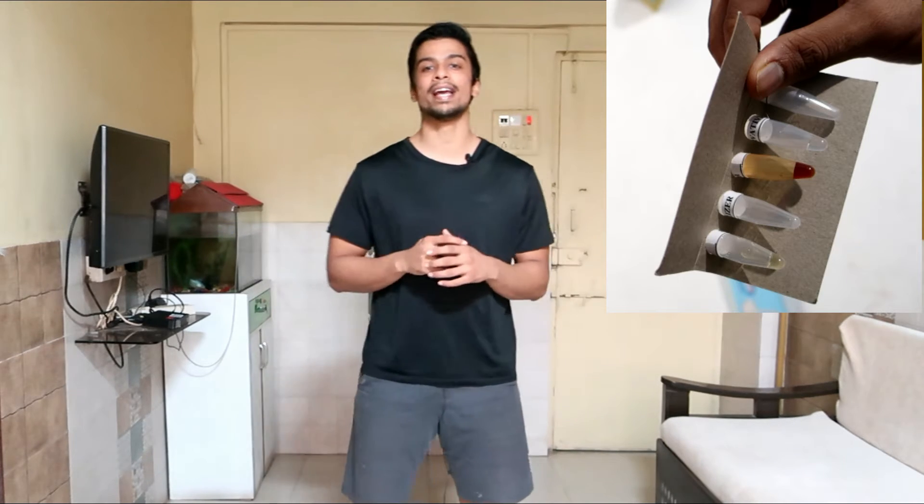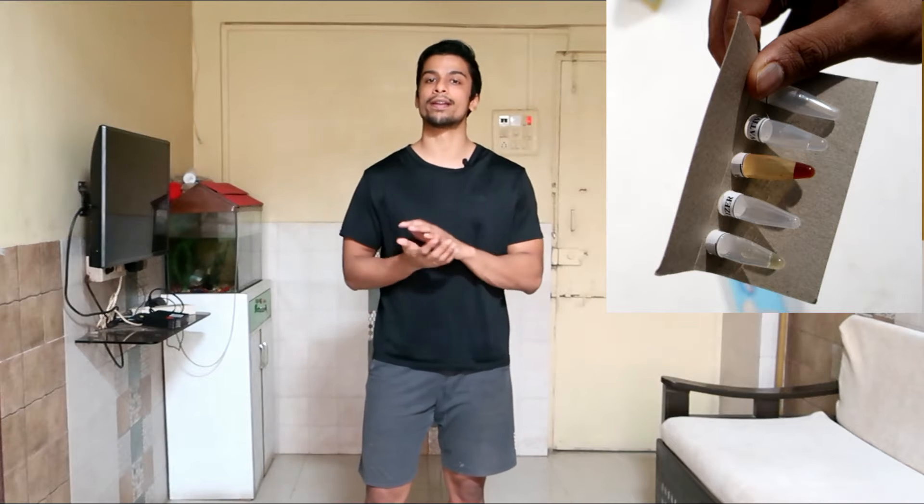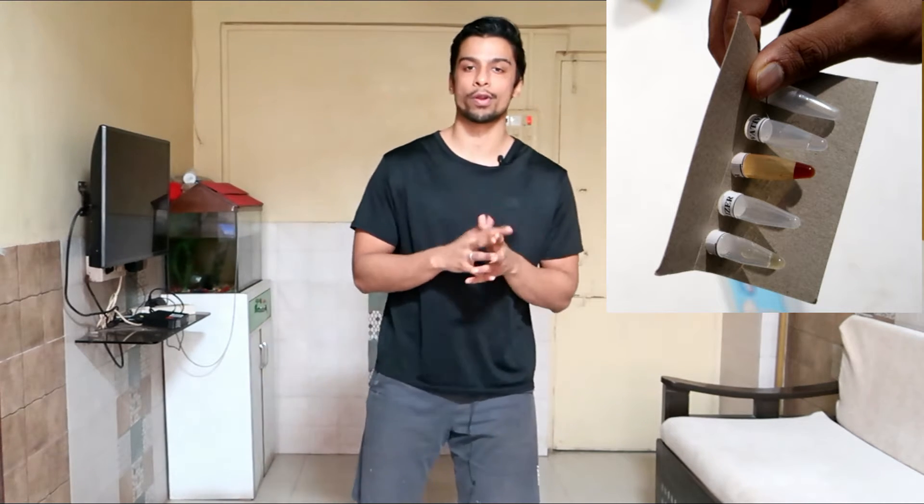It's very simple to test for adulteration using this testing kit. You just have to add five to six drops of milk into the tubes provided in the kit, shake it well, and then check the color of the solution. Depending on the color, you will know whether the milk is adulterated or not. Now let's test both variants — Amul milk and desi cow milk — and see which one gives a better output.